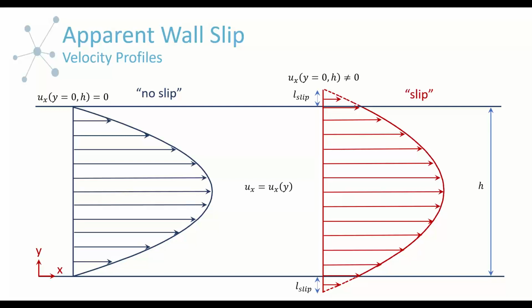And this is actually a situation, and we're going to go into detail about this, where you can actually correct this problem. We can't correct the turbulence happening. We can only identify it and acknowledge that it exists. For a given material and flow conditions, we can't necessarily stop that or correct for it. However, this is a situation that we can correct for.